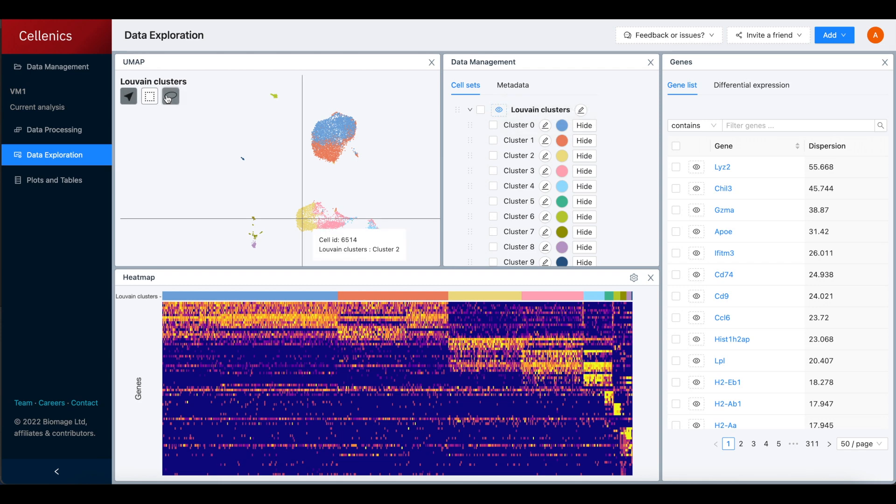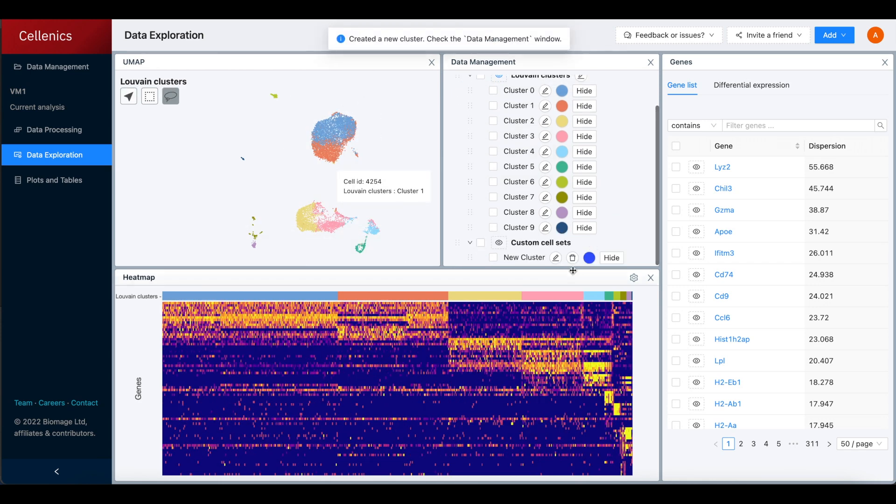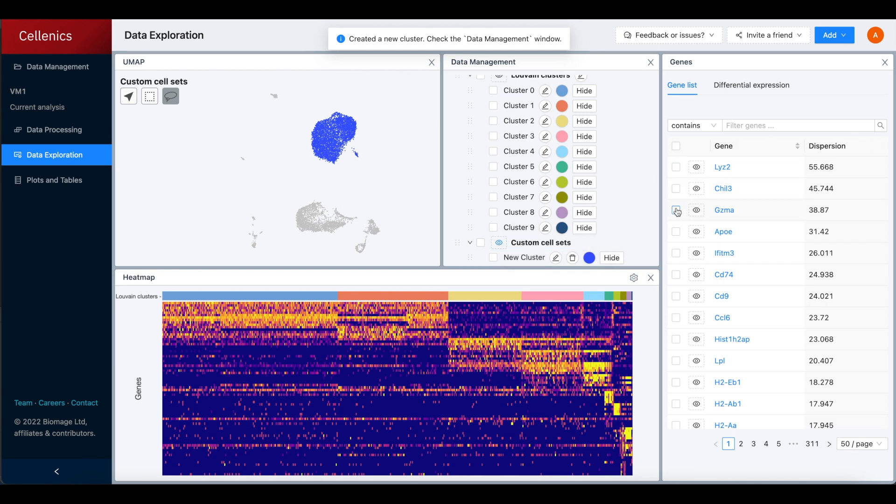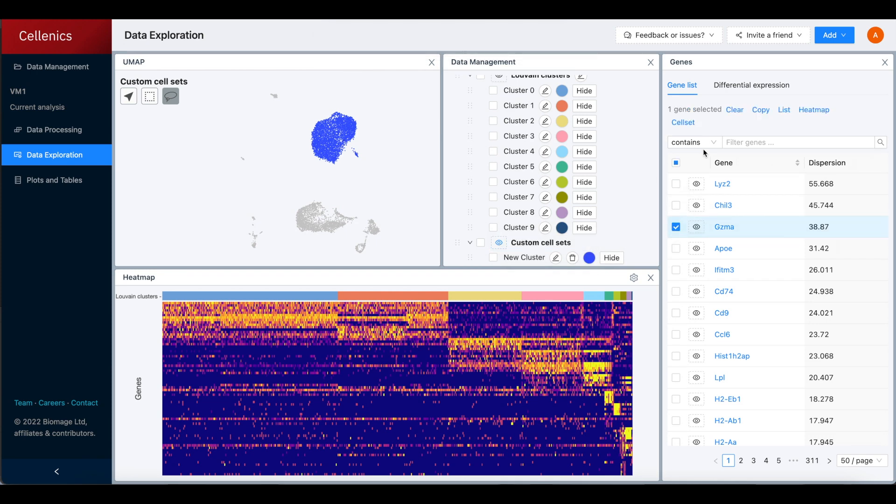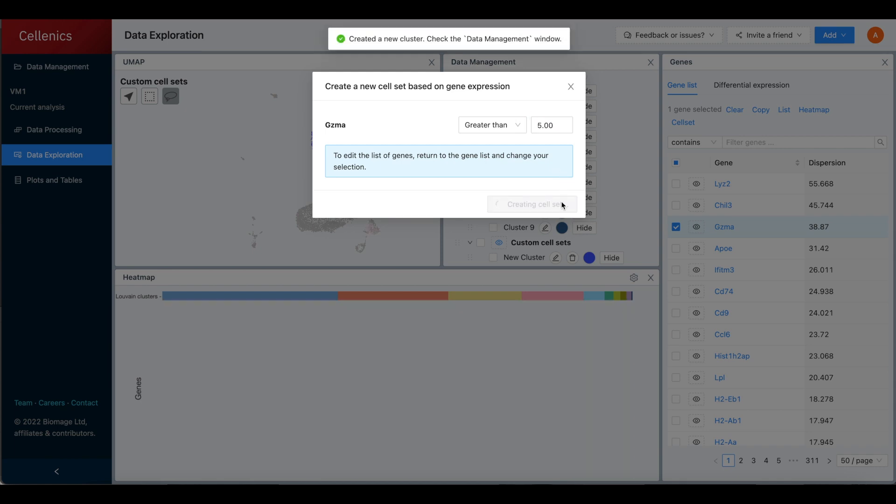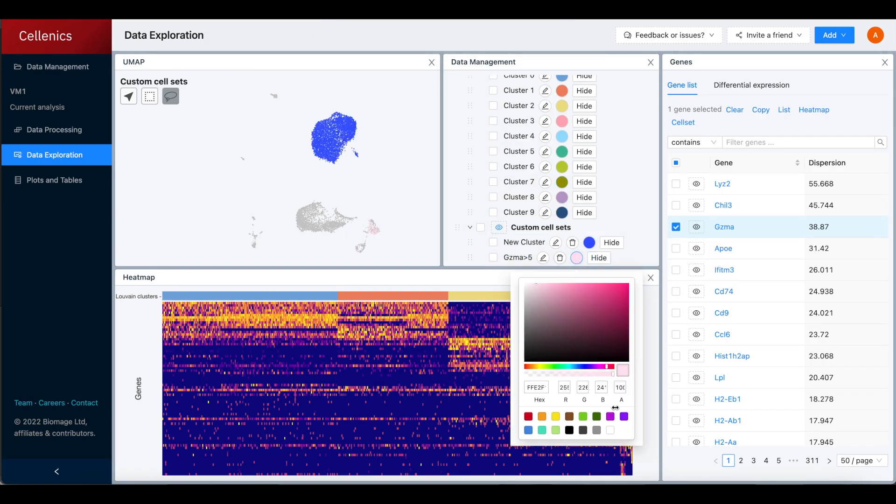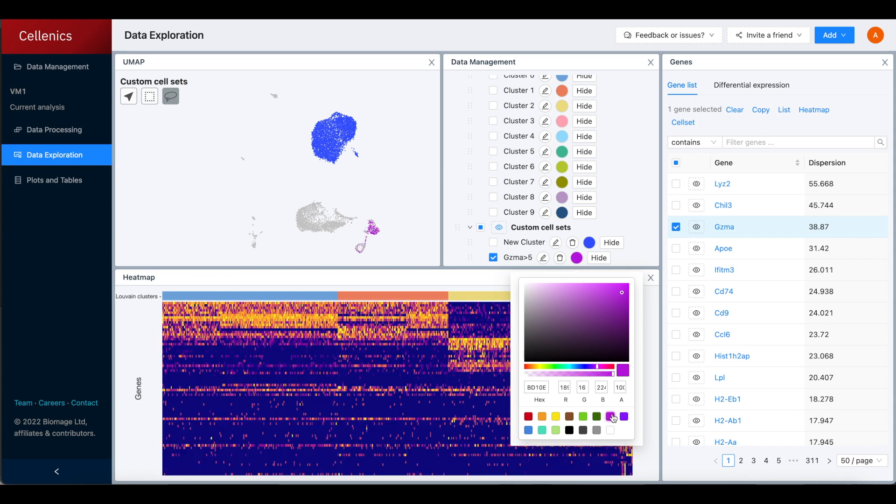Custom cell sets can be created using the lasso or rectangle selection tools in the embedding. Alternatively, new cell sets can be generated based on the expression of one or more genes in the gene list. All cell sets can easily be renamed and recolored.